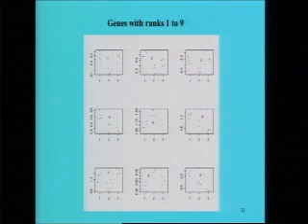So what we notice from the first strip chart is that this rank 1 gene has a profile of the following type. It is overexpressed in the first group, that is the Vata group. It is underexpressed in the second group, that is Kapha prakruti, and it is again overexpressed in the third group, the Pitta prakruti. So this rank 1 gene is expressed at a low level in Kapha prakruti individuals. So this may be interpreted as a marker gene for a Kapha prakruti individual, because it has a low expression in Kapha prakruti, but it is more or less equally expressed in the Vata and Pitta prakruti.